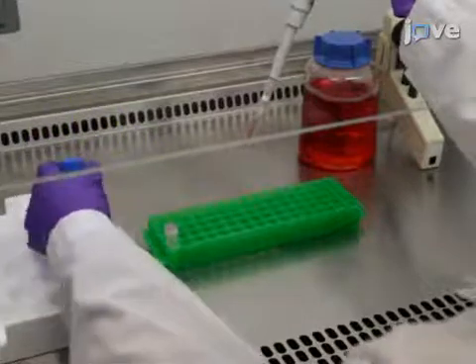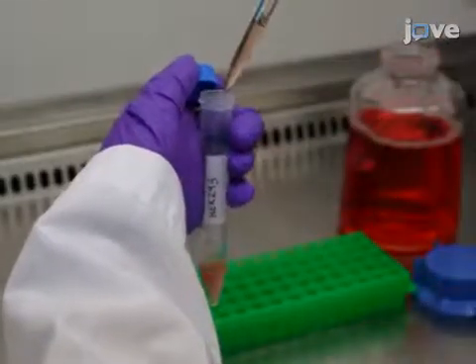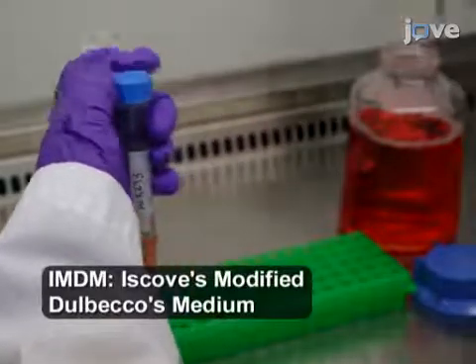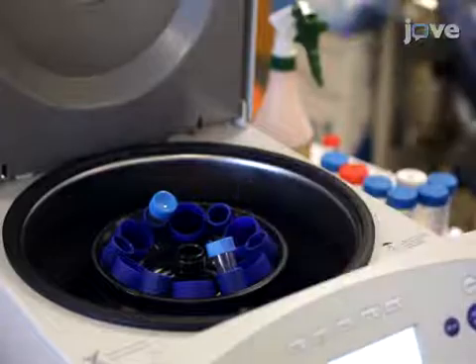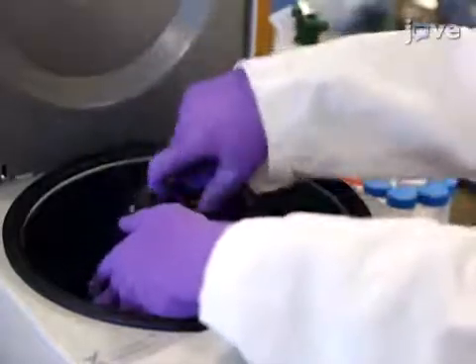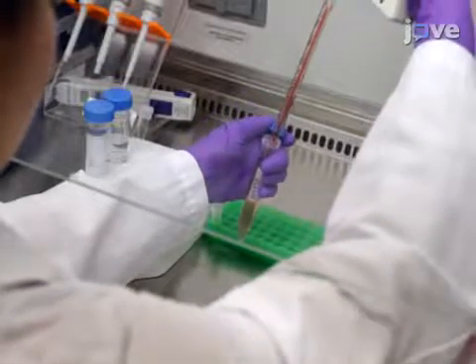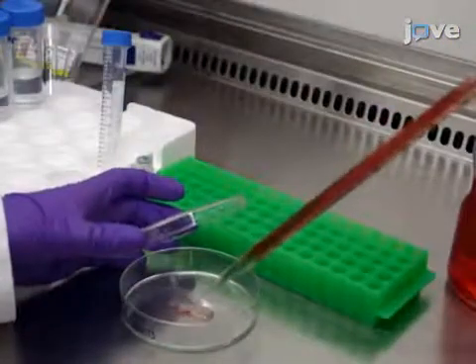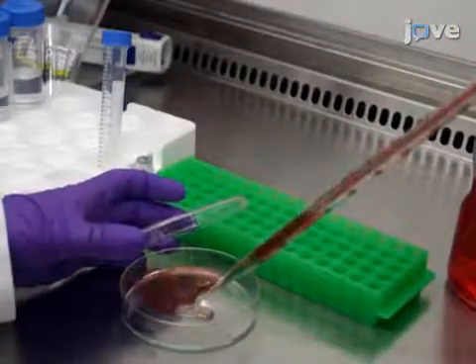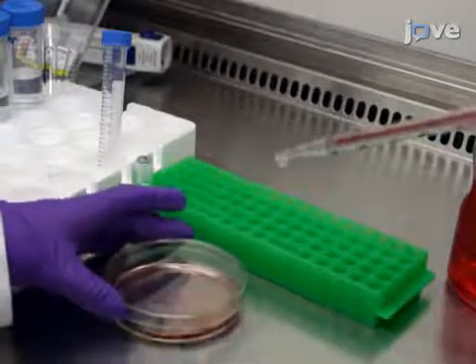Begin by pipetting all of the thawed cells from a cryotube into a 15-milliliter conical tube. Next, add 2 milliliters of pre-warmed CO2-equilibrated complete IMDM. Then centrifuge the cells for 5 minutes at 500 times g. Afterward, aspirate the supernatant and re-suspend the cell pellet in 10 milliliters of complete IMDM. Plate the cells onto a 10-centimeter cell culture dish and incubate them overnight at 37 degrees Celsius in a 5% carbon dioxide incubator.